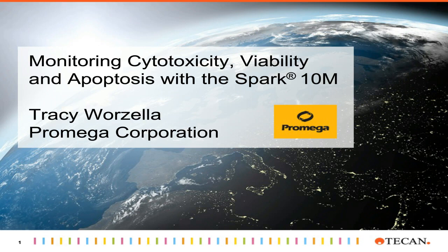Today I'm going to be speaking about an application that we developed in collaboration with Tecan to measure viability, cytotoxicity, and apoptosis from the same sample well as a means to determine compound mechanism of action. My portion of the talk today is going to address the application itself, and I'm going to be highlighting features of the Spark 10M that we use for the application. And then Katrin will be providing you with more background information on the Spark 10M and its capabilities.